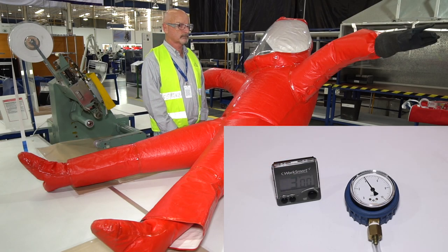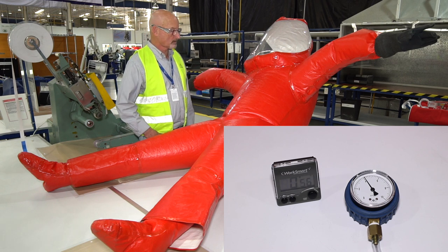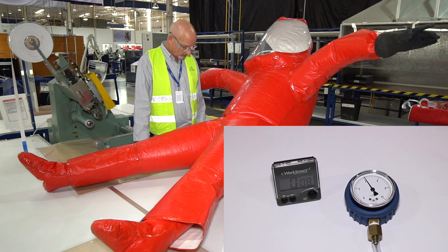After 4 minutes, the suit passes the requirements of the test if the final internal pressure inside the suit is greater than 3.2 inches H2O.